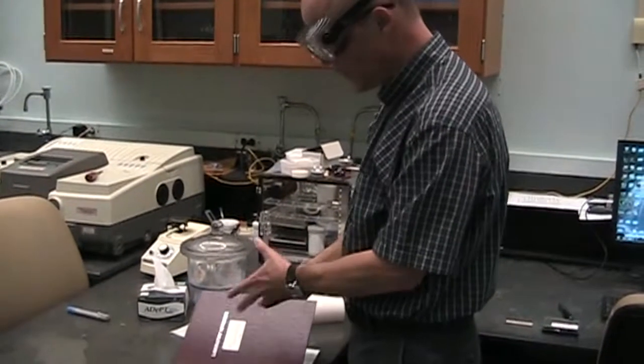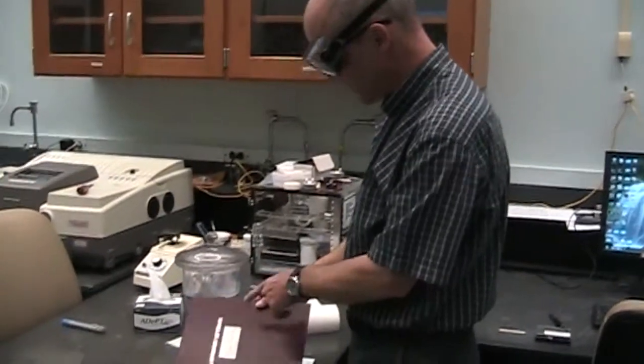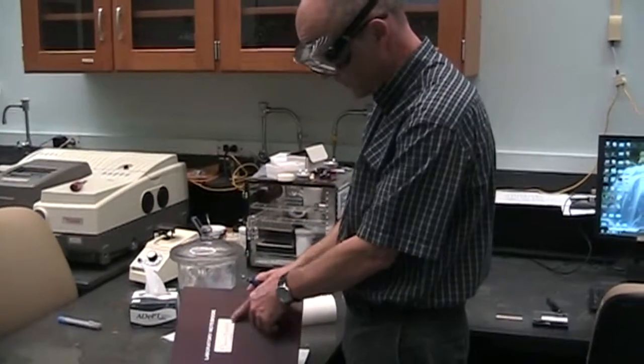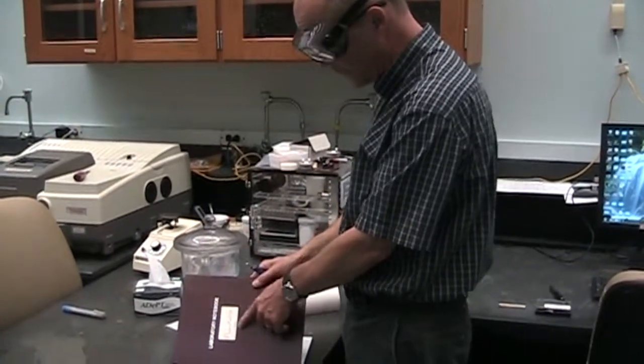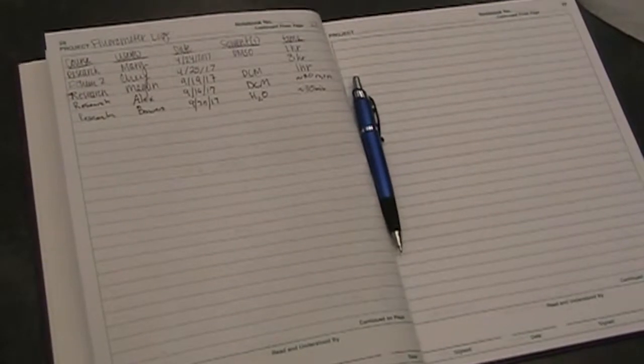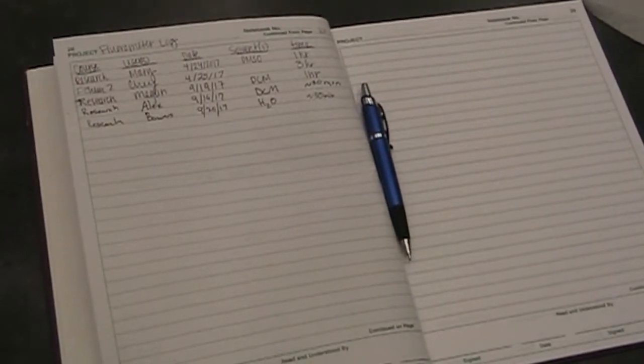So the first thing we want to do if we're going to use the instrument, we want to sign in to the logbook. So this is the Fluoromax 4 logbook, that's the name of the instrument.